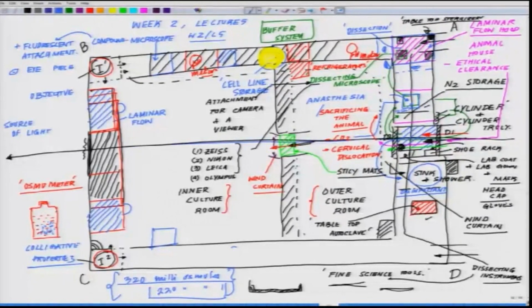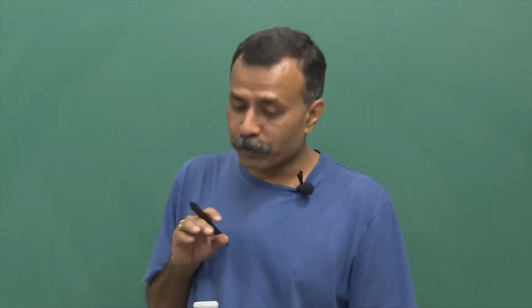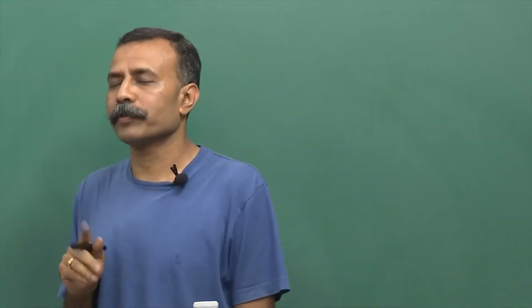This device uses a very interesting colligative property and it's fun. It is a way to keep track. So you have to have a spot where you will be putting the osmometer. Now slowly we are covering the space we have dedicated for the countertop. So now you have a pH meter, you have an osmometer.